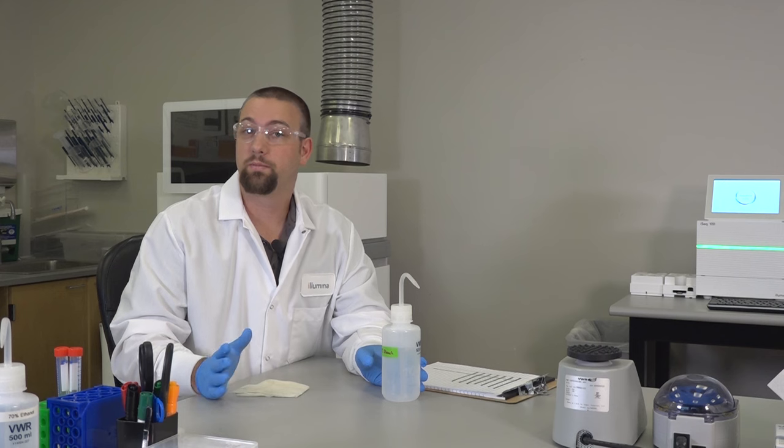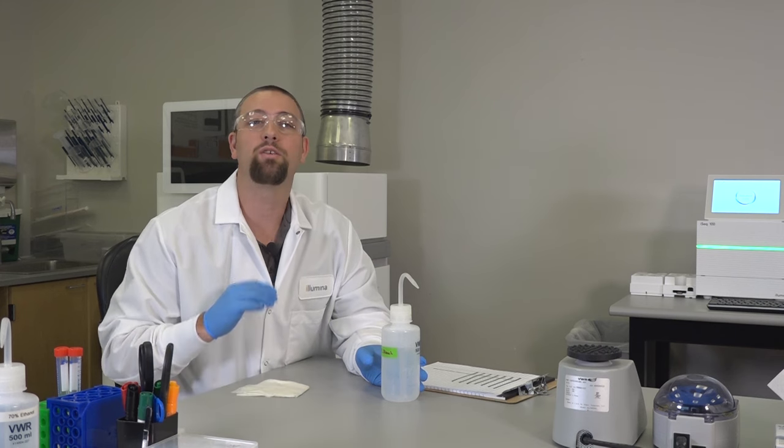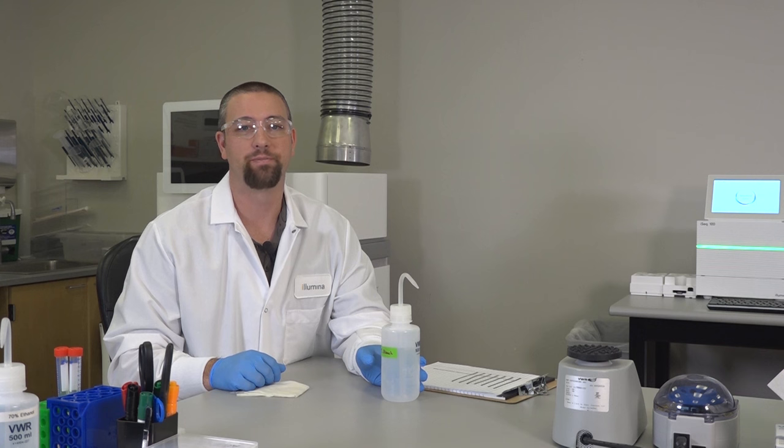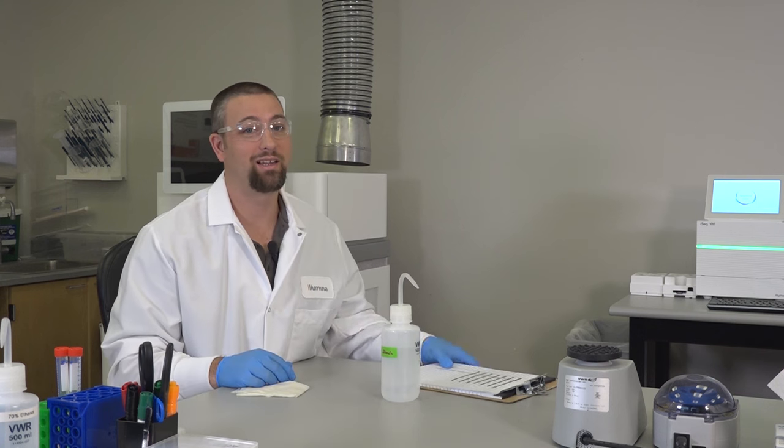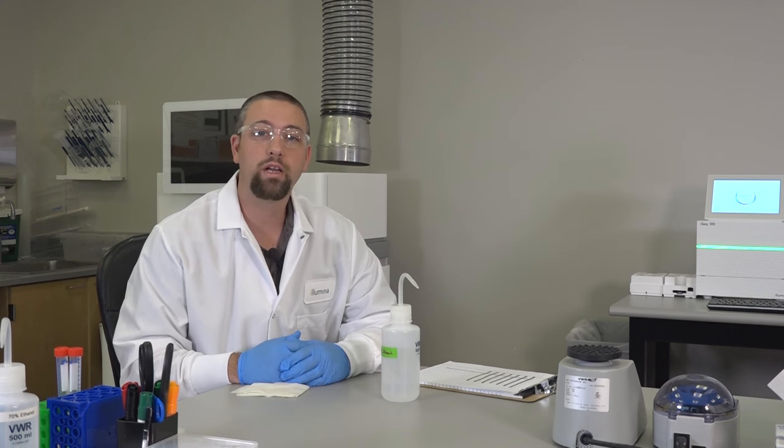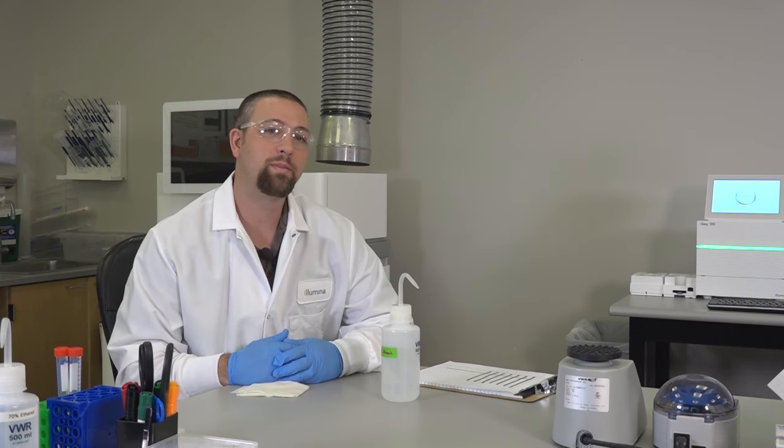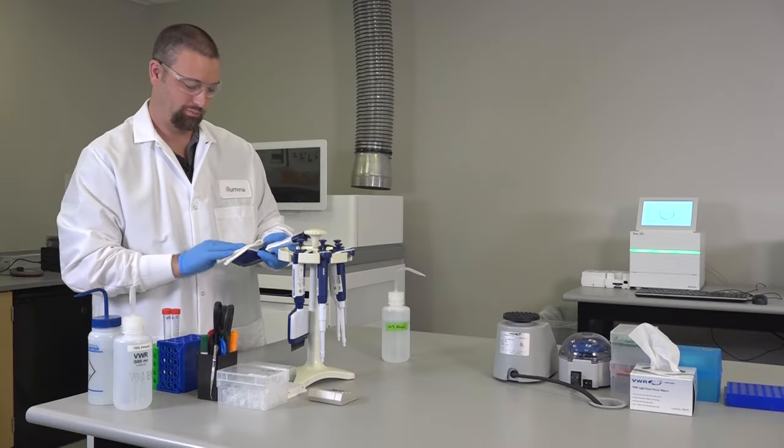Scheduled routine cleaning with a 10% bleach or approximately 0.5% sodium hypochlorite is highly recommended to prevent contamination. Typically, this occurs on a daily and weekly basis, with a thorough cleaning occurring weekly. Also, cleaning your work area before starting a procedure can proactively remove any contamination in the area.